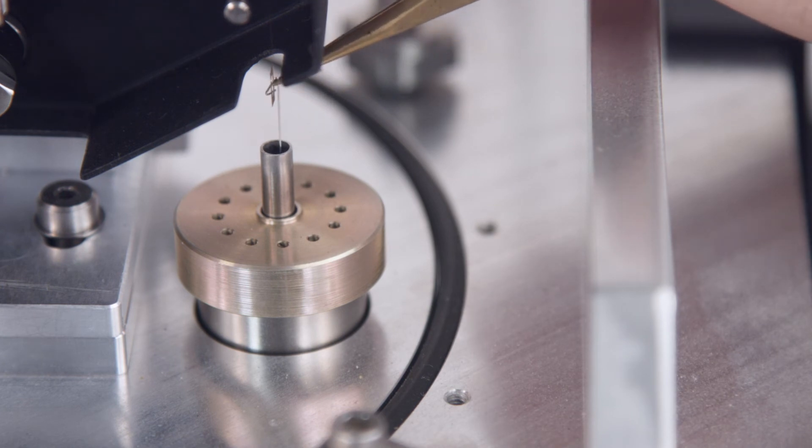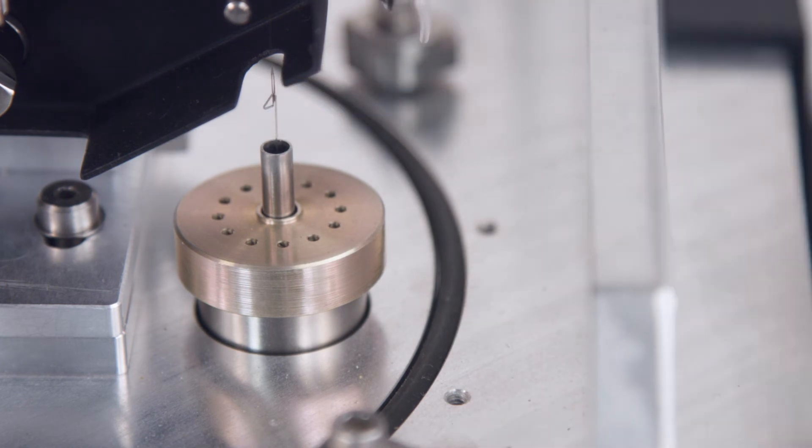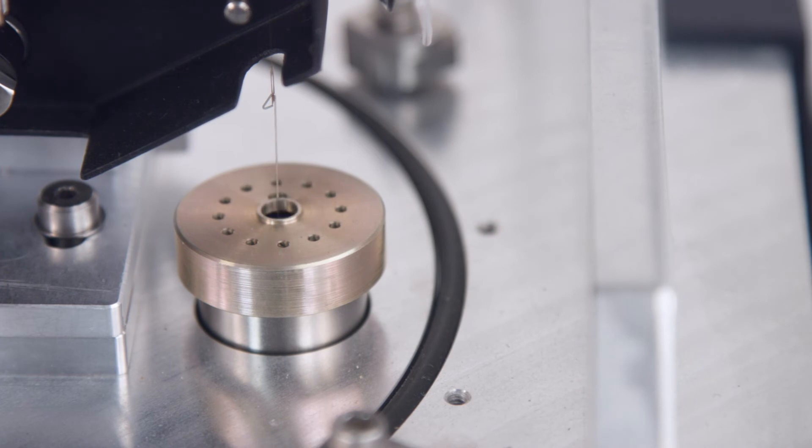Using tweezers, gently grasp the hang down wire and insert it through the eyelet in the decoupler loop. Remove the tool when finished.